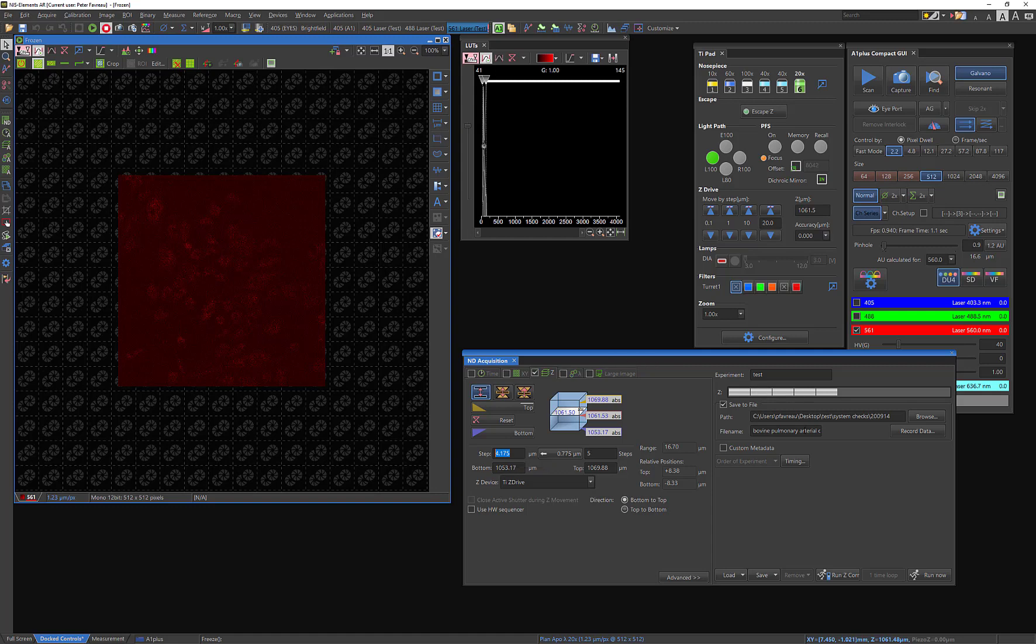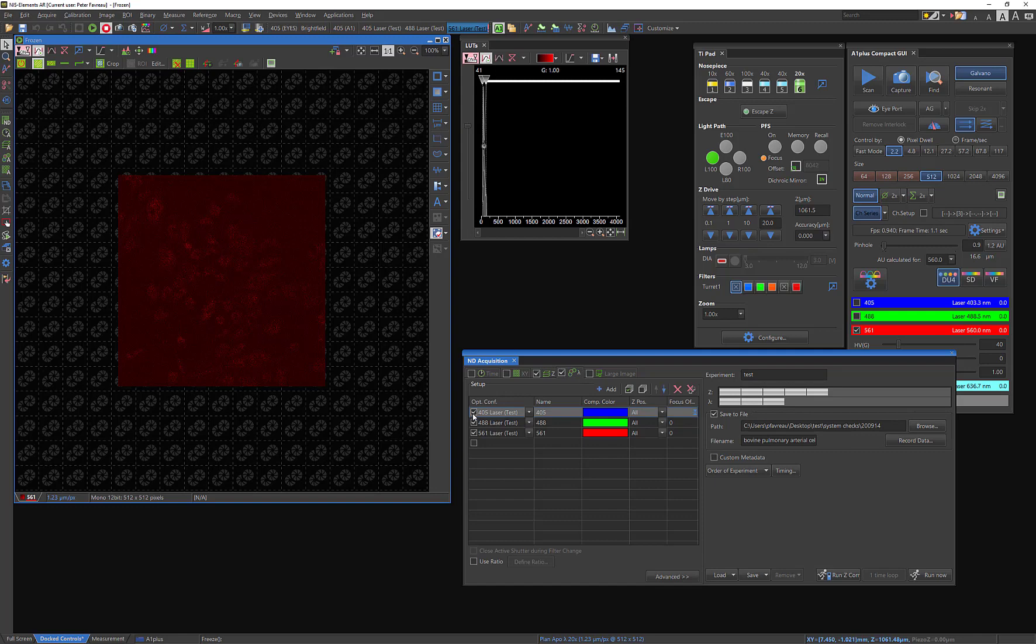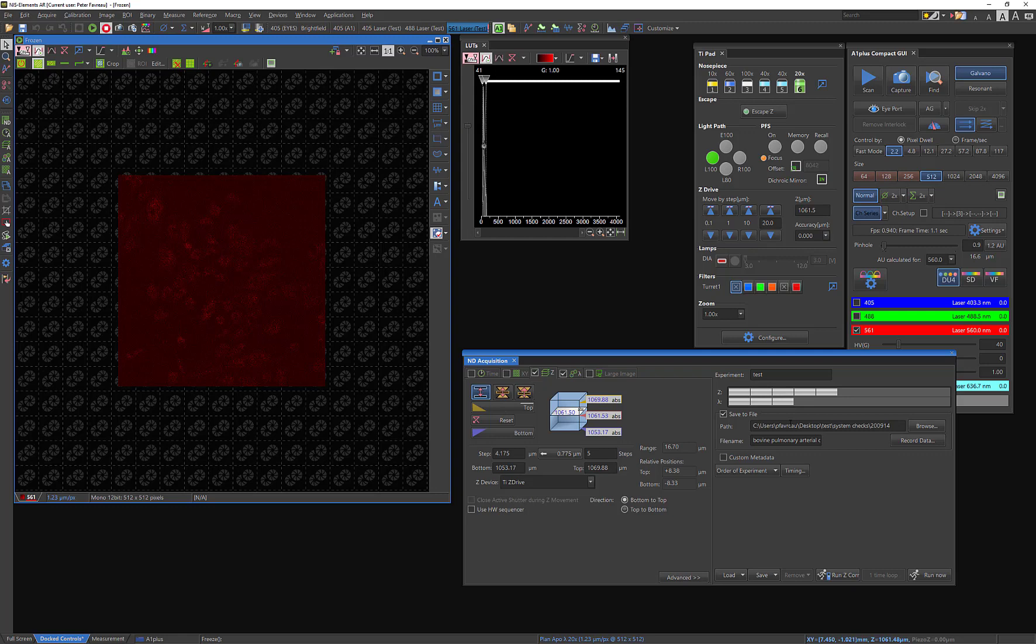So I'm not going to belabor this point too much, but once you've determined what your range is and your top and bottom, you can hit run now. And I'm actually going to select here. I'm going to ask it to take all three of these wavelengths. I'll go into detail later about how to set up optical configurations. Basically all I'm asking elements to do here is at every single z-step or focal plane, I want it to acquire all three of my wavelengths.